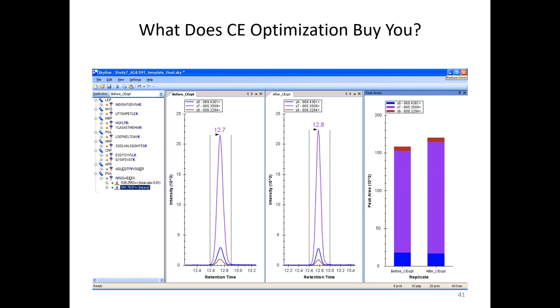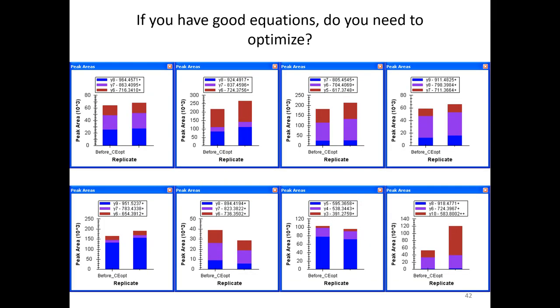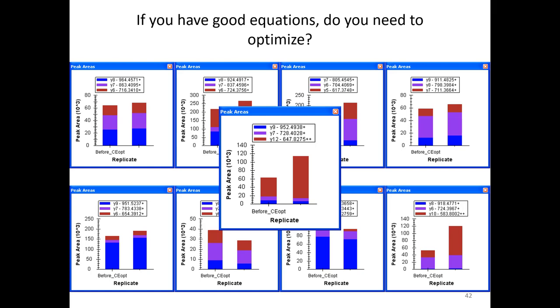It can, if you have the time, instrument time, and sample, so it may be worth doing. But these are cases where you don't really get much of an increase, maybe 10%. This is the only one that has that double charge product ion where you get a serious boost. So it's one of those things that's entirely up to you. That's another doubly charged product ion.